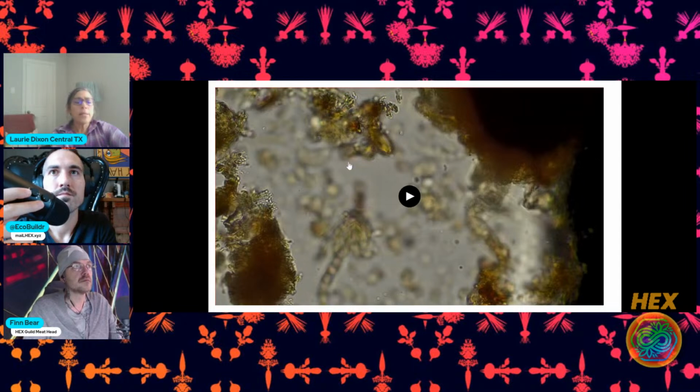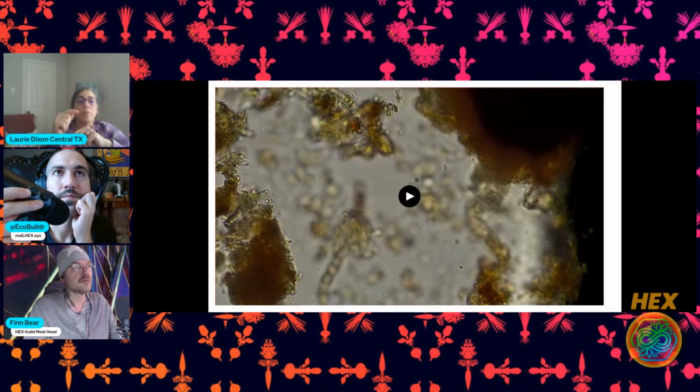If it's too crowded, you can't really identify things, because just think on that slide, the slides we're using are 15 micrometers. So, you're going 15 layers down. So we make a certain dilution, we put the drop on the slide. Just with water? Yep.